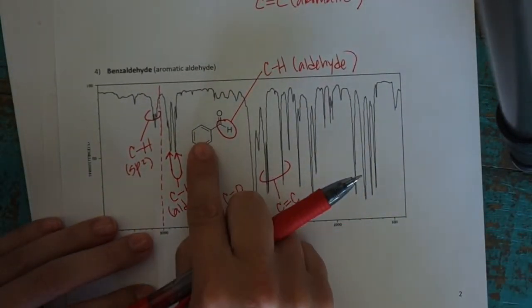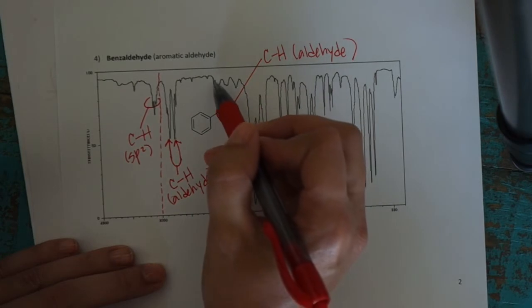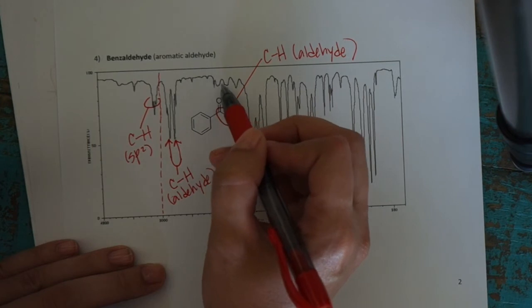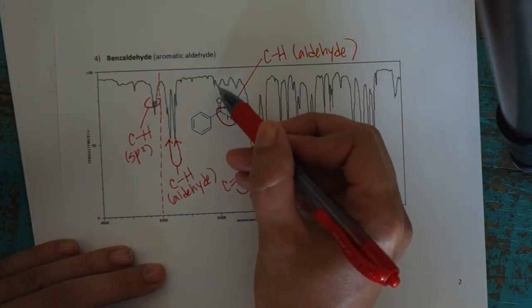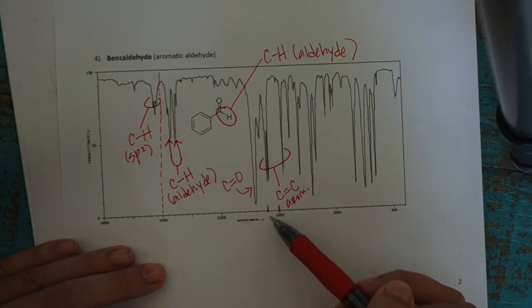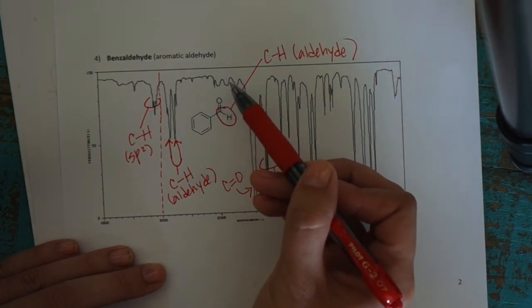The last set of peaks that you might see come from aromatic rings. And so going back to this one with the benzaldehyde. Whenever you have an aromatic ring, similar to what I just talked about with the NH2 group, you'll sometimes start to see a bunch of peaks here. And they call those aromatic overtones, and again, that has to do with other types of motions that the aromatic ring is going through. And again, you never need to label these, but if you see stuff there, don't let that throw you off. If you see stuff in this region, 2000 to 1500, those are going to be sharp, strong peaks. They're not going to be these little tiny peaks up here, so you don't need to worry about that.